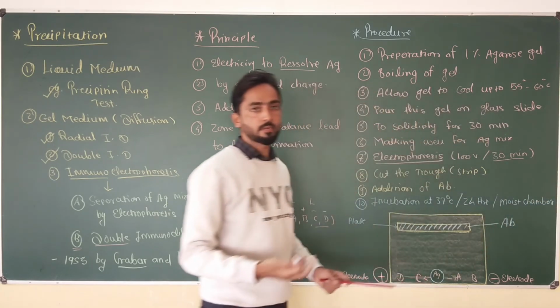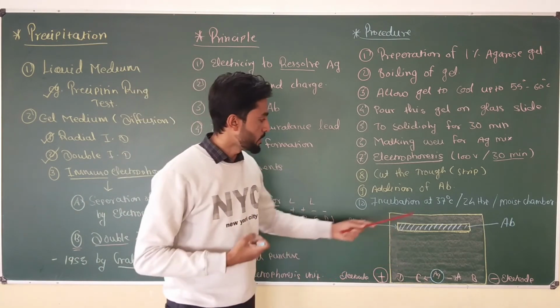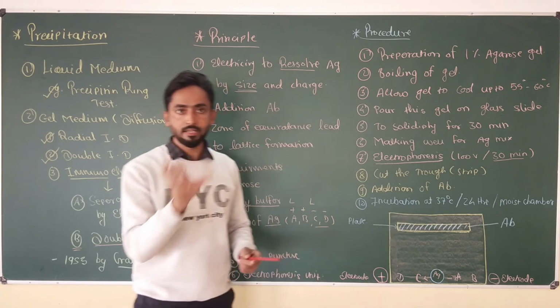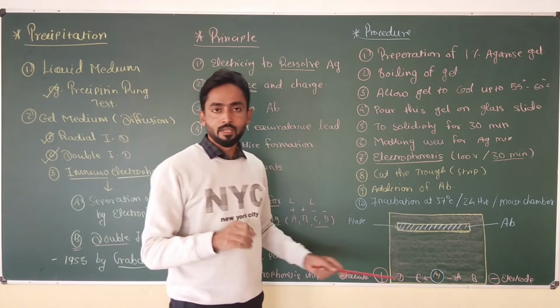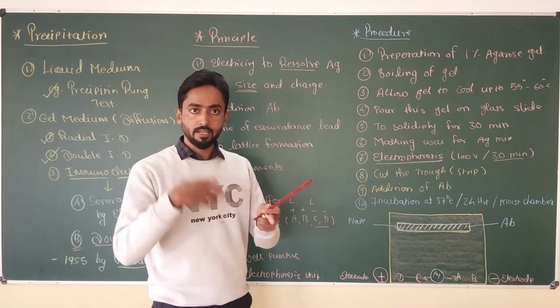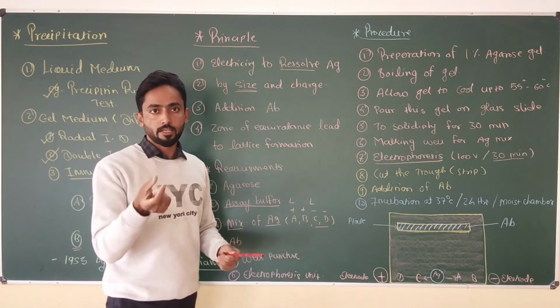Because it is an antigen-antibody reaction which requires moisture, the gel may get dry during the incubation, so we have to maintain the moisture, and for that we have to keep this glass plate in a chamber for maintaining moisture, and for that we can use cotton balls soaked in glycerol.